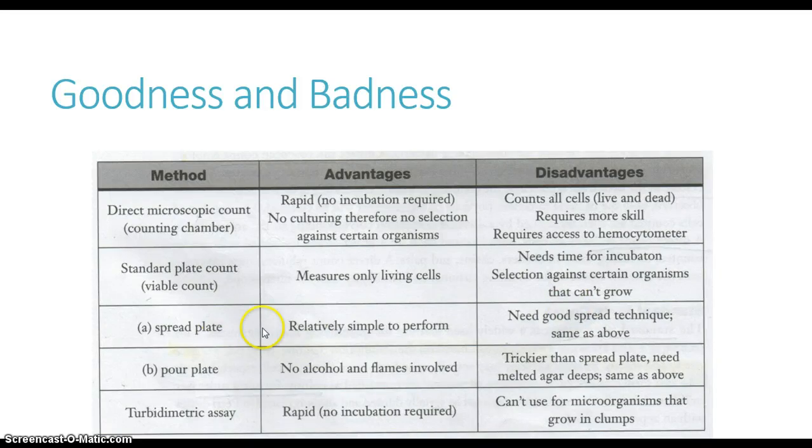The spread plate is relatively simple to perform, which is good, but you need a good technique, and it just corresponds to the standard plate count as well. Pour plate, it's good that there's no alcohol, there's no flames involved, so you're not killing anything that you don't want to kill by accident. But it is trickier than a spread plate because melted agar can get tricky. You need melted agar as well, and all this stuff corresponds to both spread plate and pour plate.